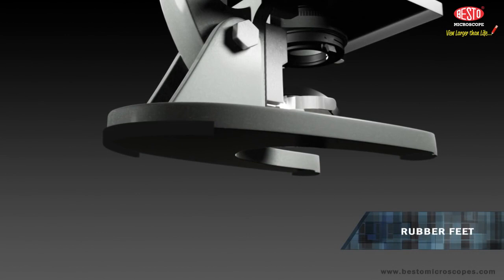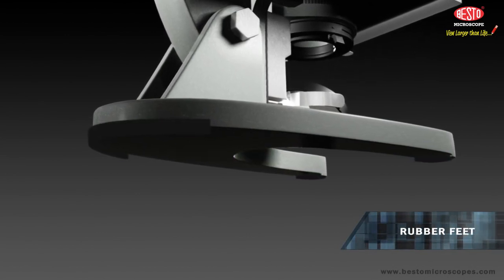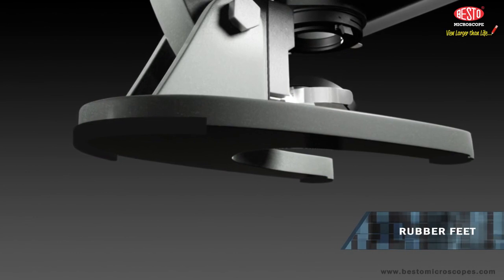Rubber feet. A microscope with rubber feet prevents skidding and scratches on the work table and also provides positive grip.